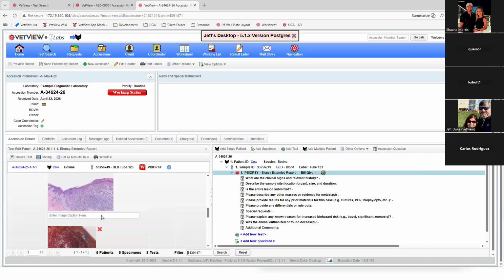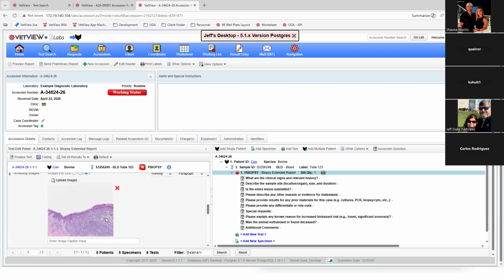The images themselves are like inline images for reporting purposes. The attachments are riders to that. So to answer your question, Carlos, we don't merge PDFs together.